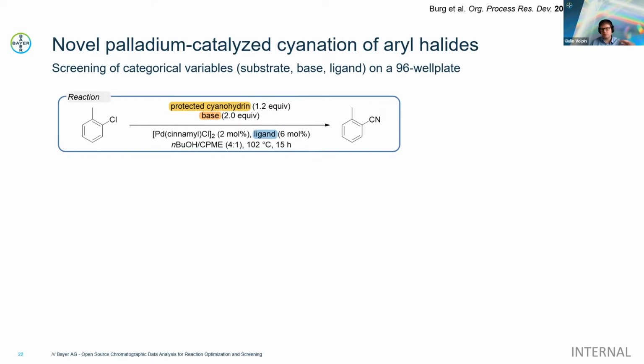So it's important to always keep the concentration of free cyanide low and create high enough turnover that this concentration is so low, because it's either added slowly to the reaction mixture, which was achieved by slow addition of the cyanide, acetone cyanohydrin, via syringe pump, or it is consumed at such a rate that forms the benzonitrile in a way to keep the system catalytically competent for the time of the reaction.